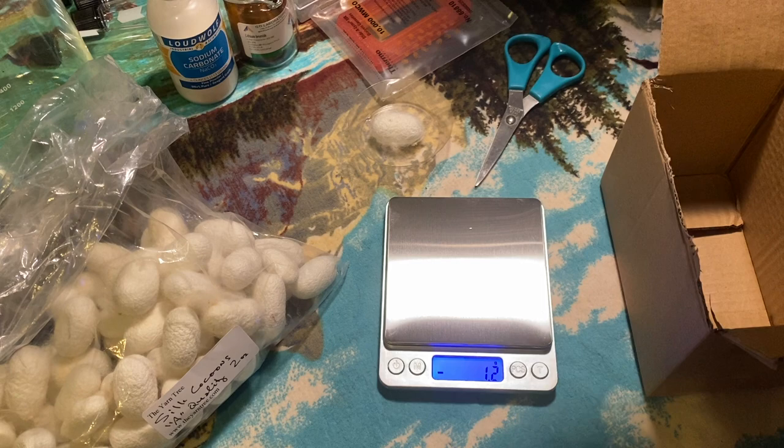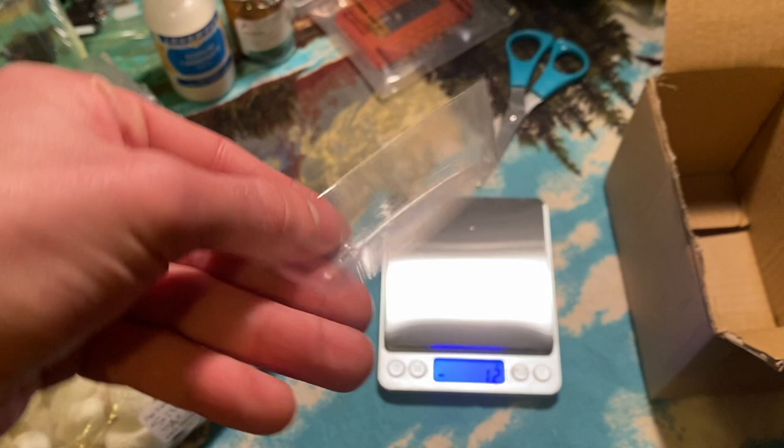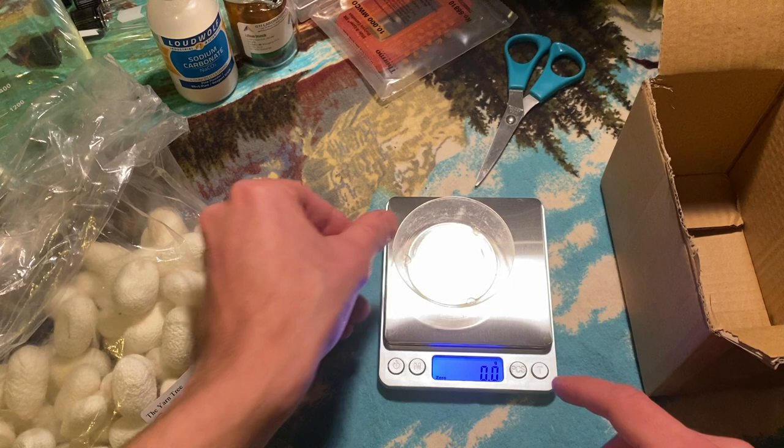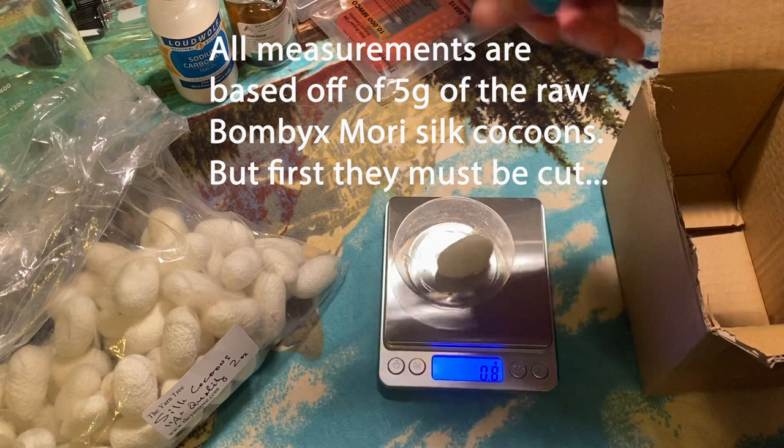To create the right chemical solutions, I need 5 grams of silk cocoons by scaled measurement. With the worm inside, each cocoon weighs about 0.9 grams, so I removed the worms from most of the cocoons to get the correct weight.